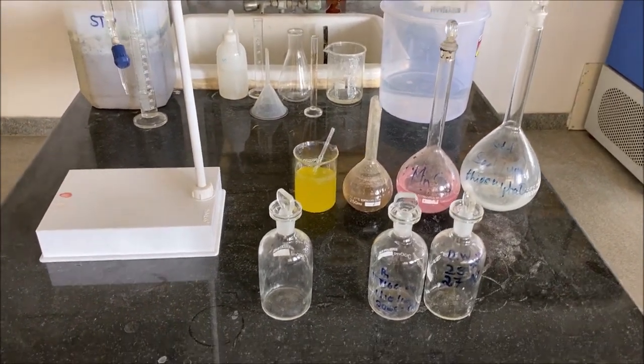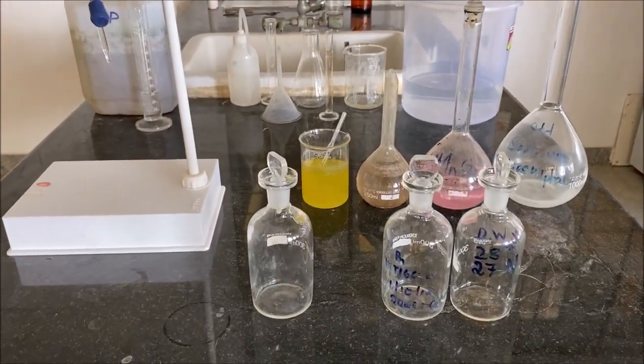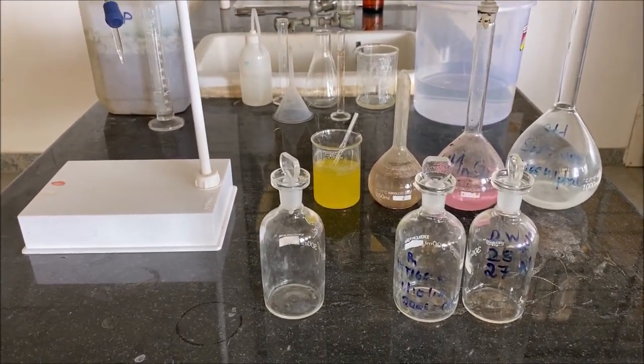Three different BOD bottles are utilized for conducting this experiment.